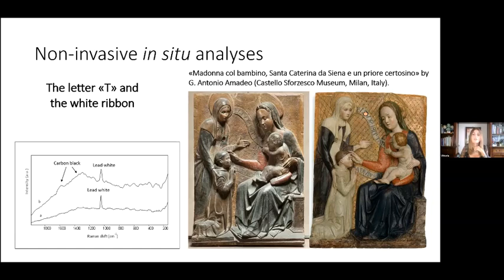Therefore, this unique feature of Raman spectroscopy finds application in all those fields that require detection of carbon-based materials, for example, graphenes, carbon nanotubes, etc. Given the good results in these in-situ measurements, a further analysis will be carried out.